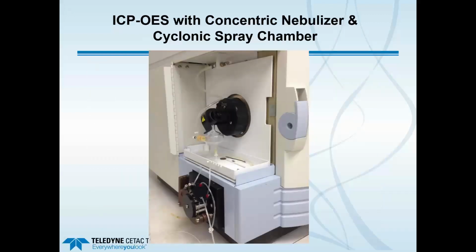Okay. So opening up the side door, here you see the conventional nebulizer and spray chamber used with the Optima 5300 system, and directly below it you see the built-in peristaltic pump that is under computer control of the system. That is the pump, of course, that will also be used to send sample solution to the ultrasonic nebulizer.